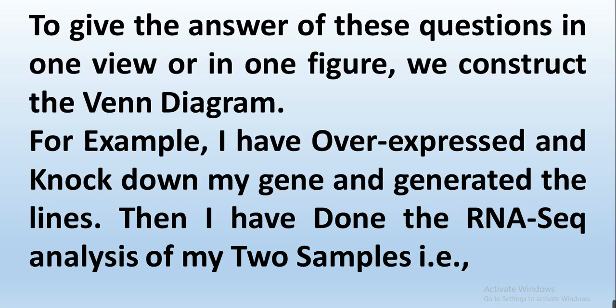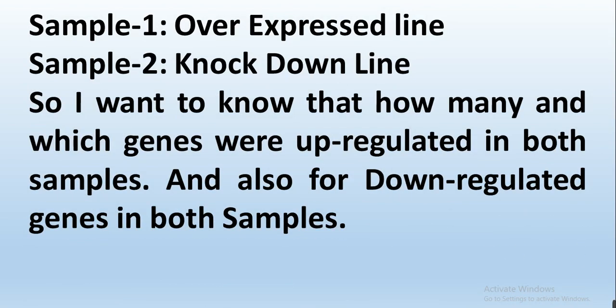For example, I have overexpressed and knocked down my gene and generated the lines, then I did RNA-seq analysis of my two samples: sample one, which is the overexpressed line, and sample two, which is the knockdown line. Now I want to know how many genes and what type of genes were upregulated in both samples — the overexpressed lines and the knockdown lines.